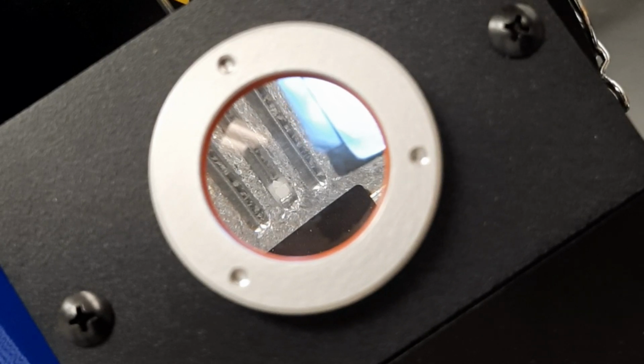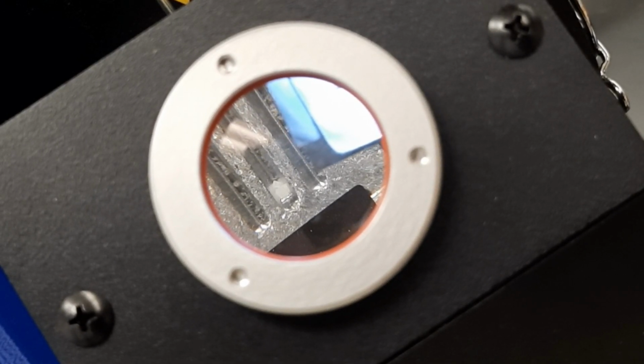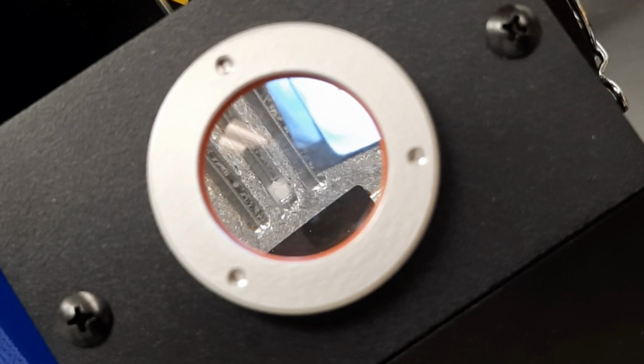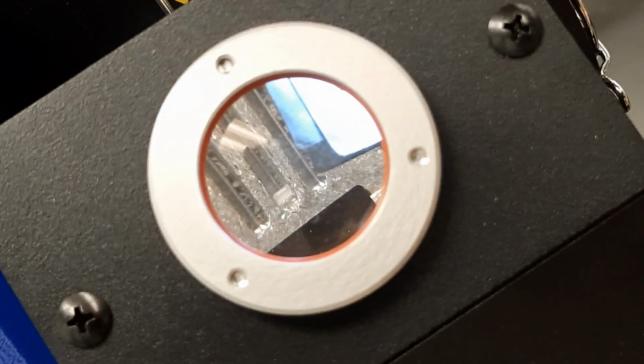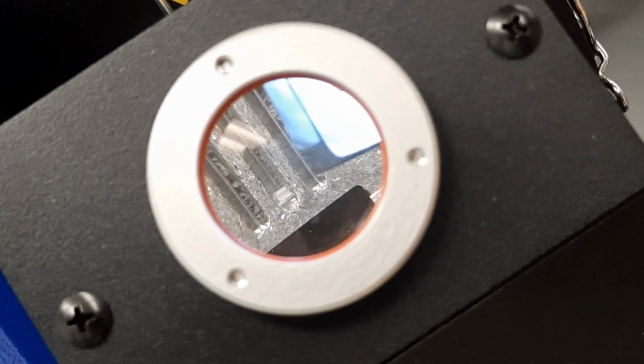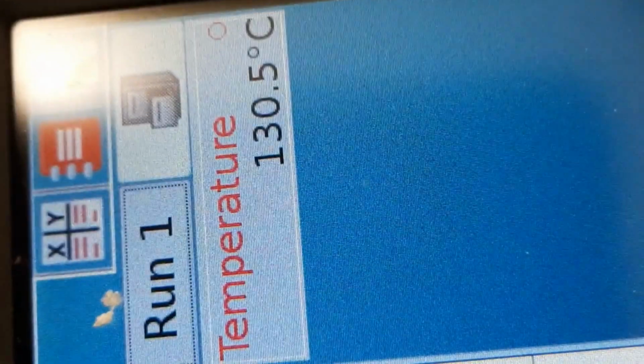This is benzoic acid melting. The temperature is at 117 degrees. When you see the first bead of sweat, you want to read your LabQuest instrument. That's my first bead of sweat. LabQuest says 122.7. It is now completely liquid in a few seconds. 122.7 was the first bead of sweat. It is completely liquid now. And the temperature at completely liquid is 130.1.